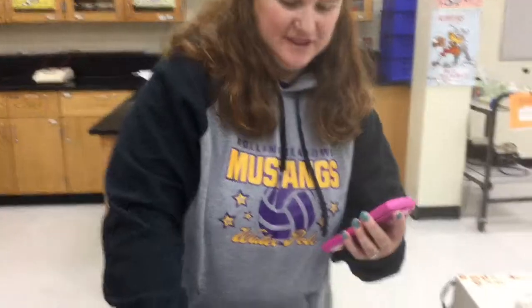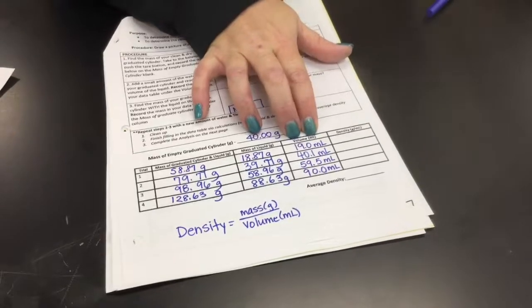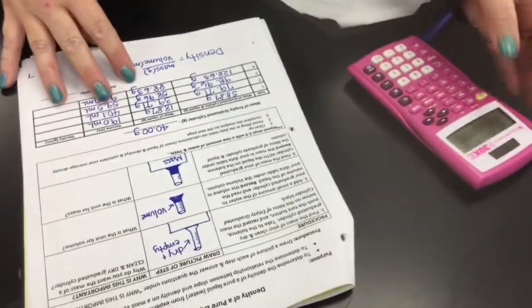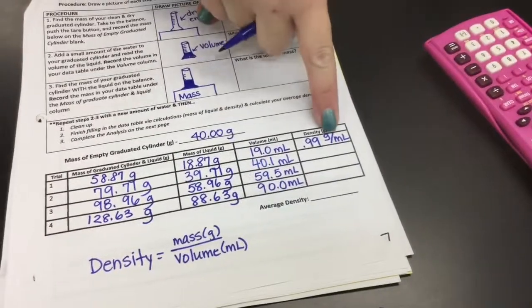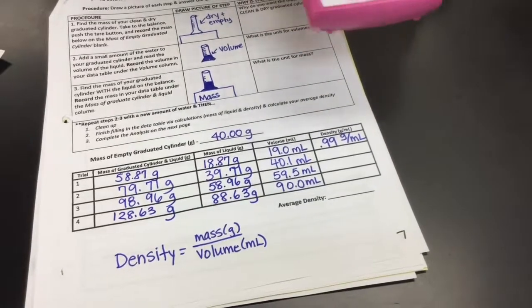Okay, so the numbers that I'm using, we're not using this number, we're using the mass of the liquid divided by the volume of the liquid. So I did 18.87 divided by 19, and I got 0.993 and so on, but I'm just going to write 0.99 grams, to the hundredths place. And we did mass divided by volume, which is grams divided by milliliters. So this is the units of density. Lovely.